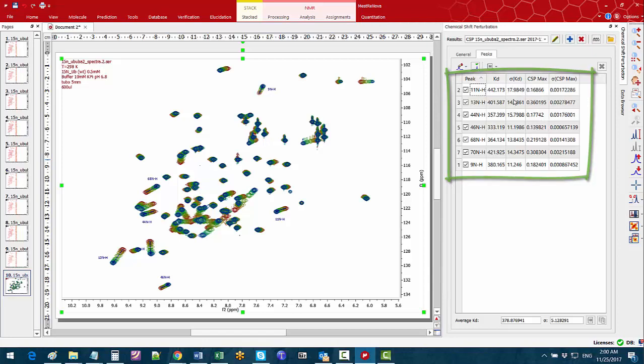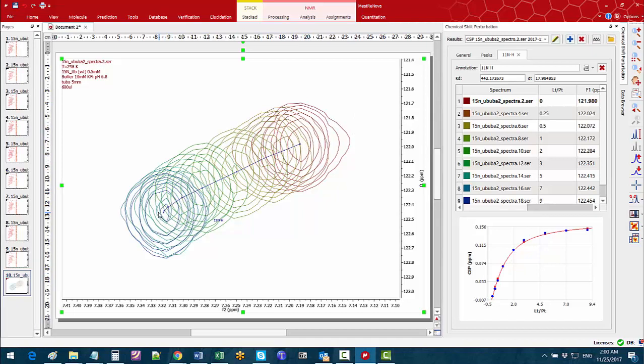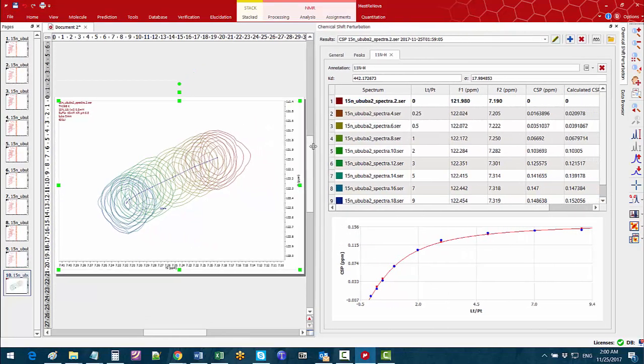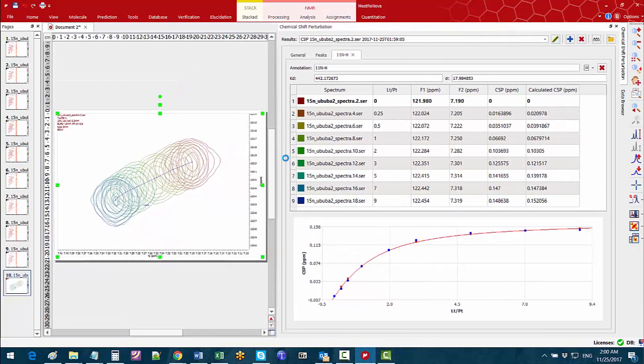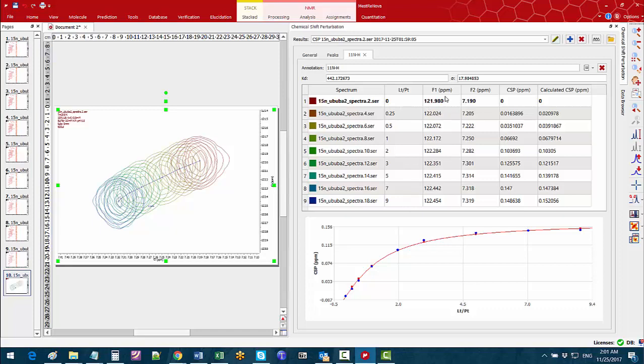If you double click on any of the rows we can see an expansion of the selected peak and see the chemical shift changes from the protein only spectrum to the last point of the titration series. You can see in the chemical shift perturbation panel the concentration of the ligand versus the protein concentration in the first column, chemical changes on each dimension, the normalised chemical shift perturbation values and the calculated values shown in the curve.